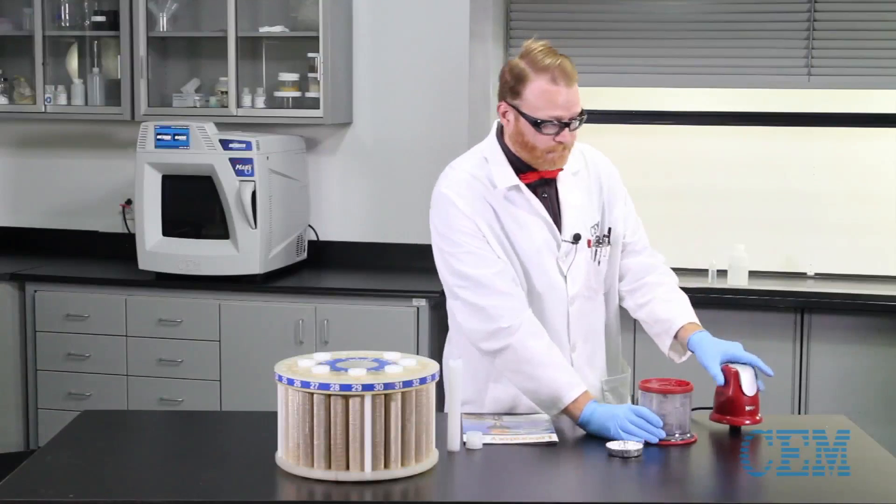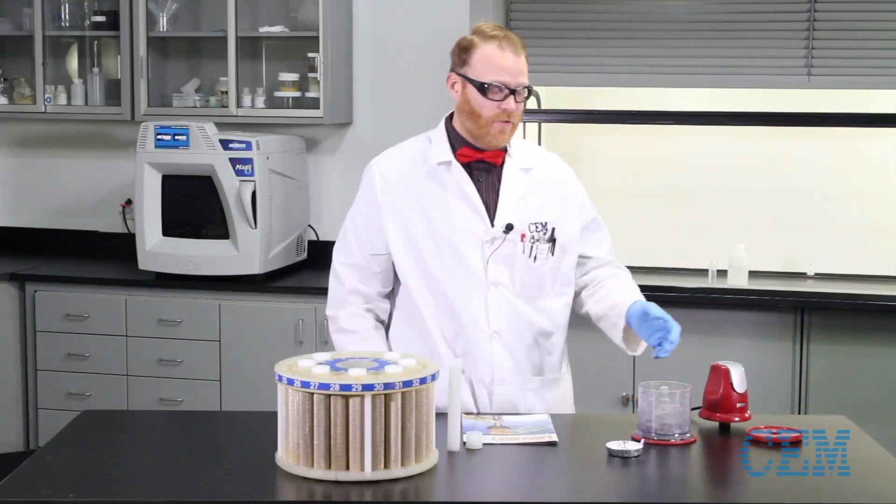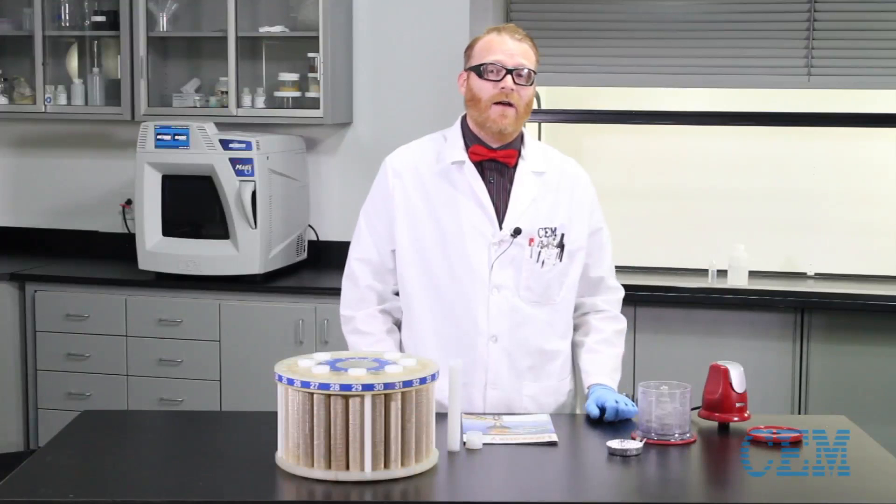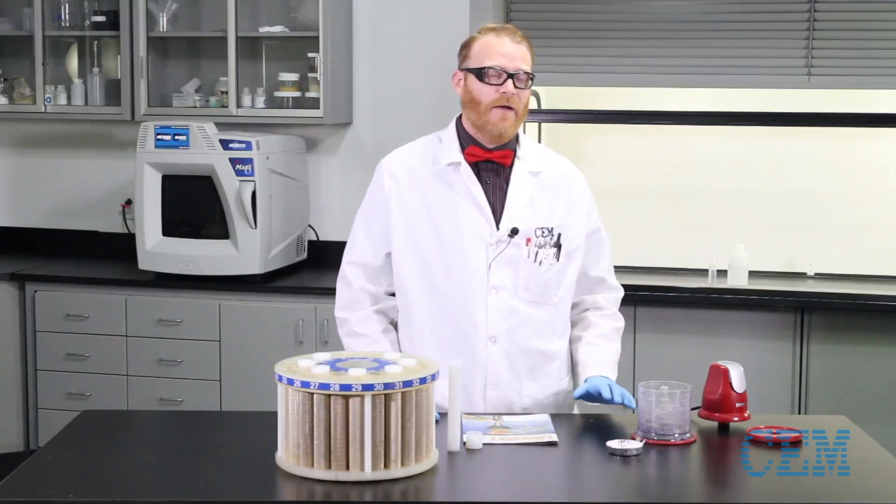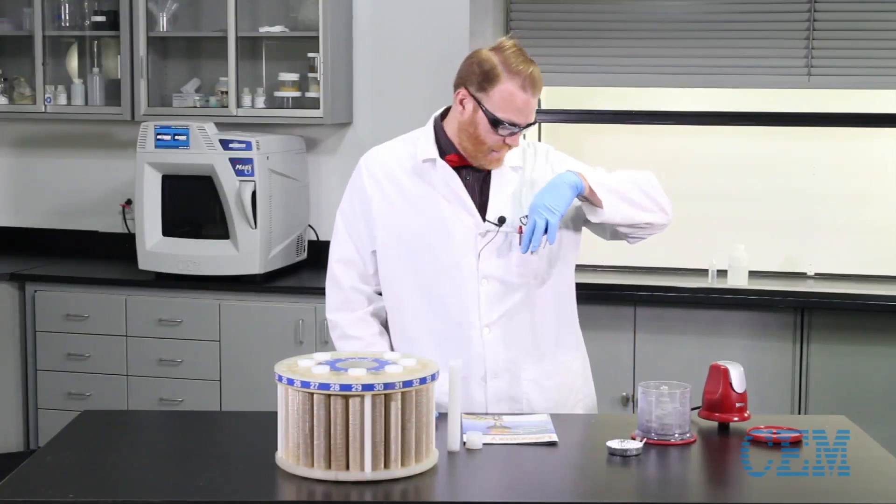So now we're going to open this up. Normally what we would do is, for an analytical sample, we would take this, put it in our aluminum pans here, dry it in a hot air oven at 100 degrees Celsius for about a couple of hours. We're not worried about that. I'm just going to take a sample and digest it.